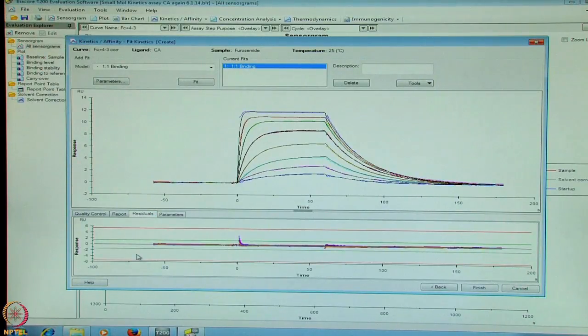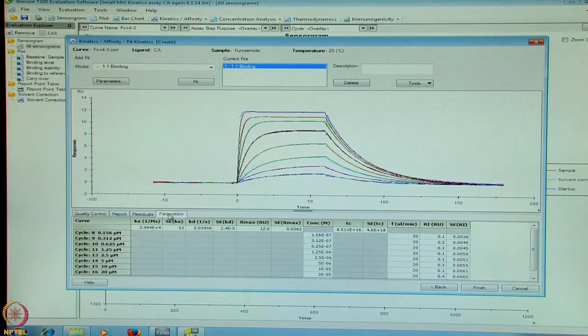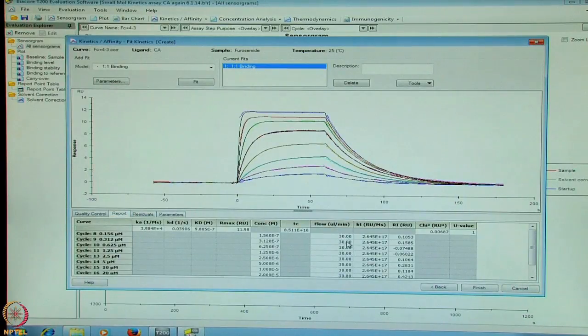Here, with the one-to-one fit of the data, the residuals or the differences from the black line to the colored line should fall within the green areas or at least within the red area. Here they are within the green areas and it looks absolutely good to proceed with this data. Similarly, other parameters like the standard error is provided here. With this, we will conclude the kinetic information generated for the interaction of furosemide with the ligand carbonic anhydrase recorded at 25 degrees centigrade and solvent corrected for the DMSO presence in the running and the sample buffers.